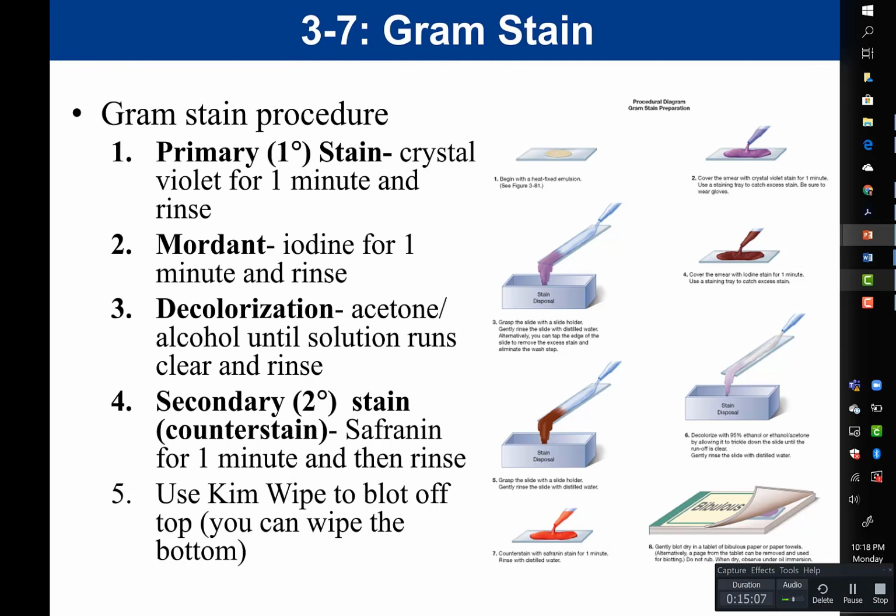You want to know that then you rinse with water and add the secondary stain, or what we also call the counter stain, which is going to be our safranin. We add it for 1 minute, then dump off the safranin and rinse. And then we would view our slides under the microscope.